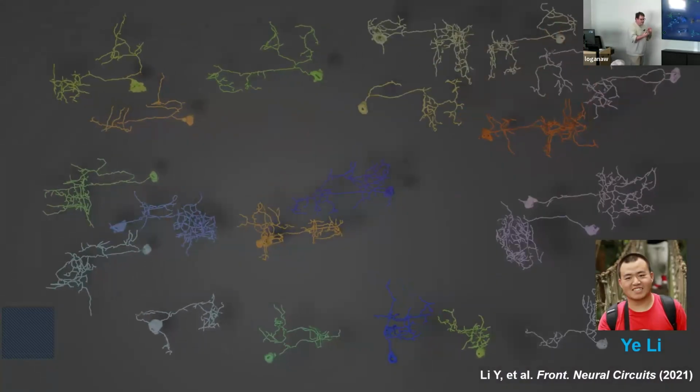All of those individual cells in the fly brain are colored with different colors of fluorescent proteins. Then we create a 3D image of them using different microscopy systems and reconstruct them bioinformatically to create these 3D cell structures of all of the cells in that neural network. In this case, we are labeling all of the serotonergic neurons in the fly brain. And there really aren't that many in one brain. But this is essentially a picture of what we're trying to accomplish there.